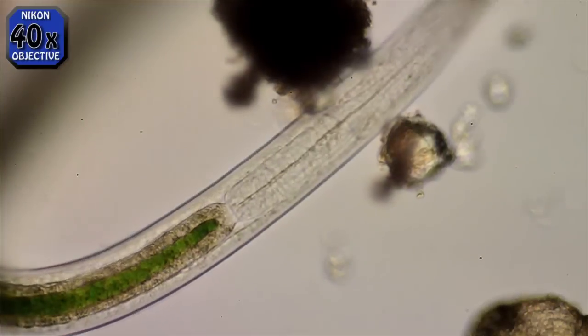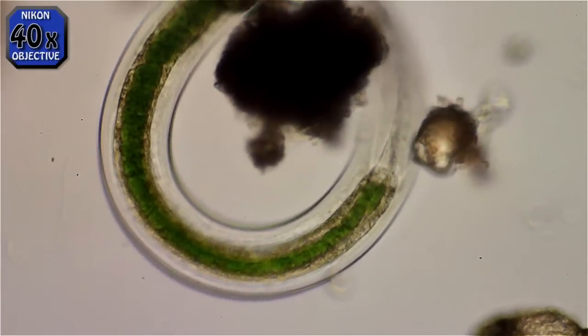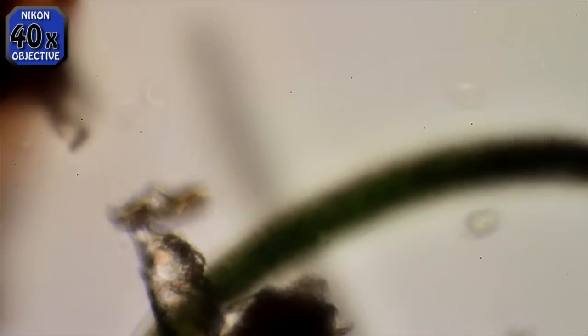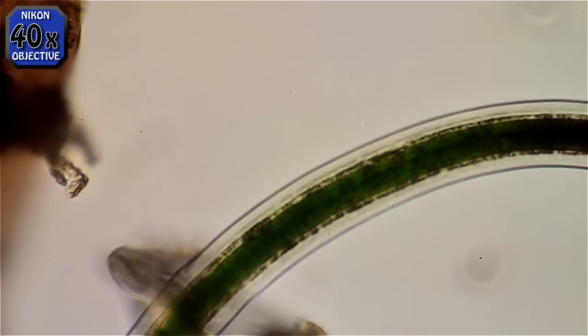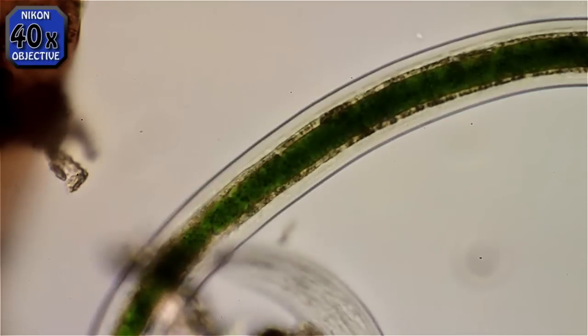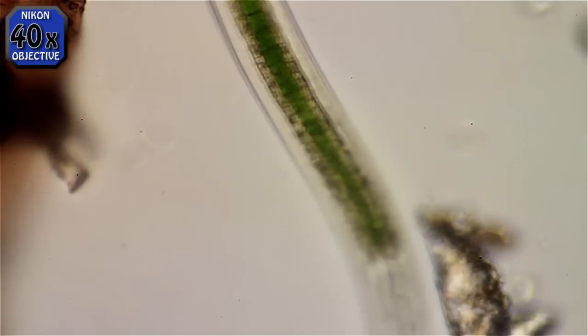This is the head end again. You can see the gullet — that little thin line in the middle leading back to the gut. The gut runs almost the whole length of the animal except for the head, and you can see where the anal pore comes out. And that's the end.